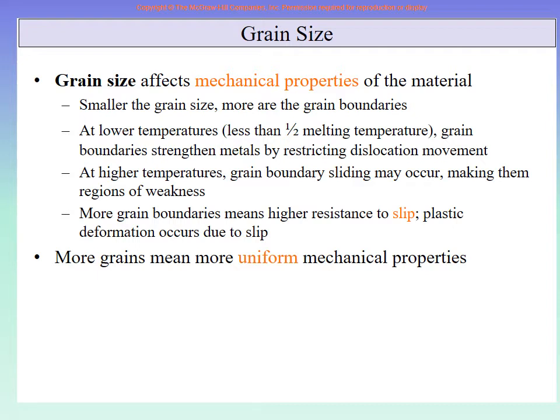So a computer is attached with it, and once we are happy with our image, we take an image at 100 magnification, we save it. We take it at 200 magnification, we save it. We take it at 500 magnification, we save it. We do not put any USBs or anything there, because we do not want to damage the machine and its high level, very costly software with any viruses and so on. So every time we do some work, we put a brand new CD or DVD inside, and we take the images, and then we send it to all of you.